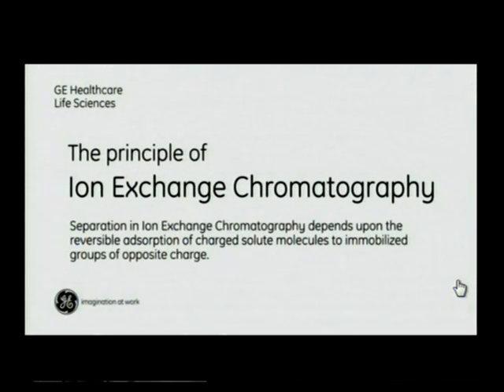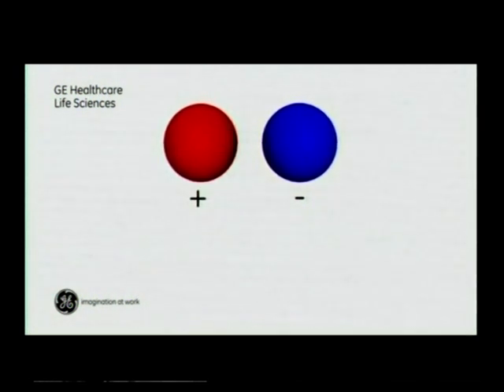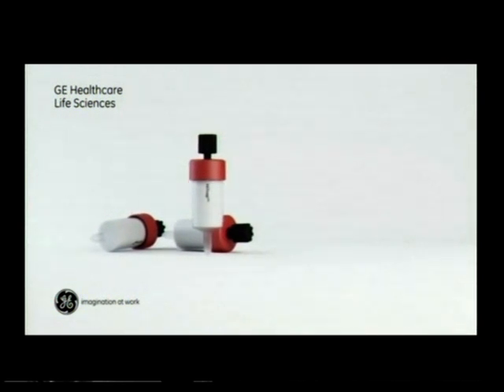This is the video on ion exchange chromatography. It is based upon the reversible adsorption of charged solute molecules to immobilized groups of opposite charge. Most ion exchange experiments are performed using resins as a stationary phase.